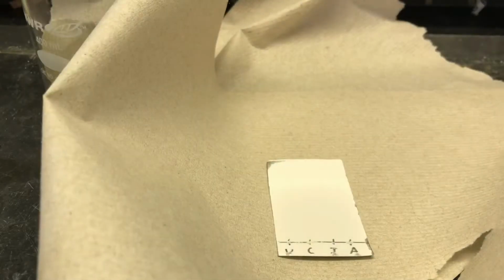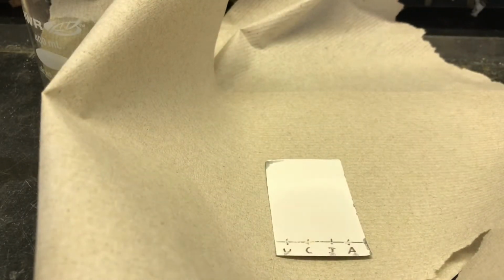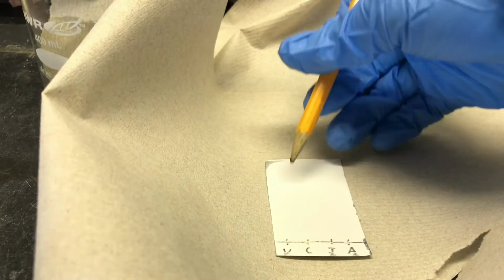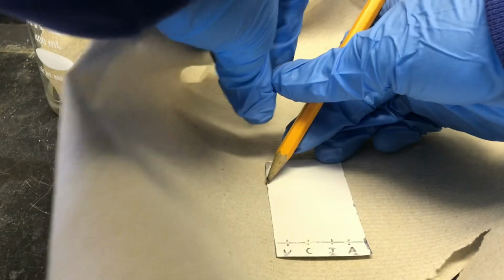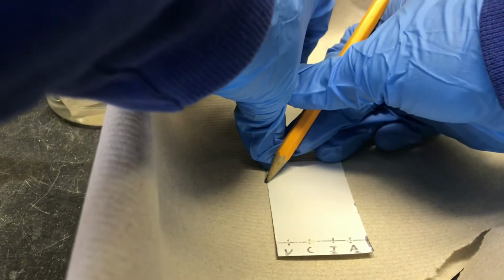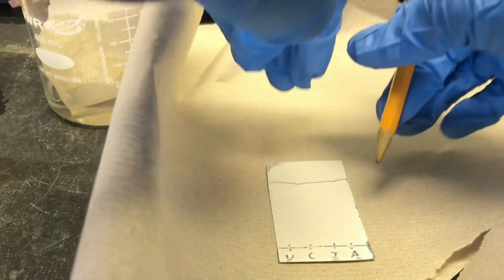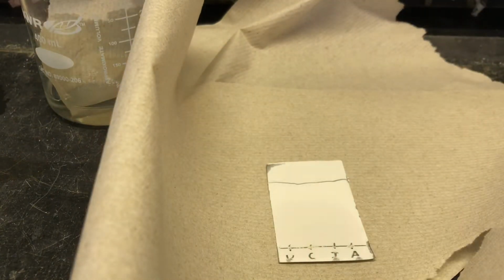Alright, so now that that's all done, what you're going to want to do is make a pencil marking right where the liquid line went up to, which is right about here. In our case, apologize for the horrible line, but you should get the idea. Anyway, what we're going to do next is visualize it in UV light.